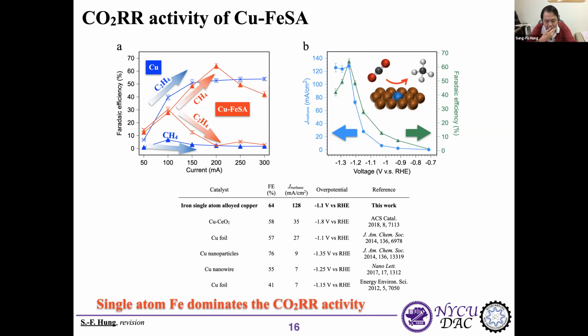Okay, so in this case, the single atom iron just dominated the carbon dioxide reduction reaction selectivity, instead of the copper one.